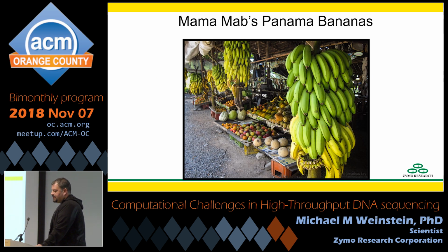All right. And to just give an idea for one of the algorithms that is the basis for how we do our alignments now, I'm going to introduce a fictional store called Mama Mab's Panama Bananas. Why did I come up with this ridiculous name? Much like DNA, there's actually a fairly limited letter space in this. You'll also notice there's a lot of repeating letter elements here. You'll see the ANA appear a lot. The AMA appears a couple times. So a lot like DNA, very limited alphabet, and quite a few repeating letter motifs.